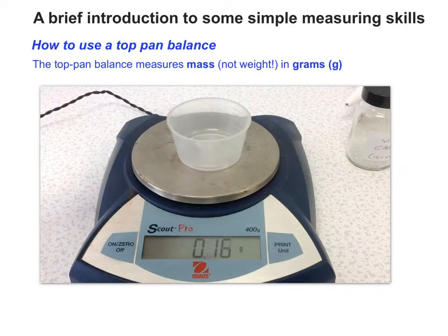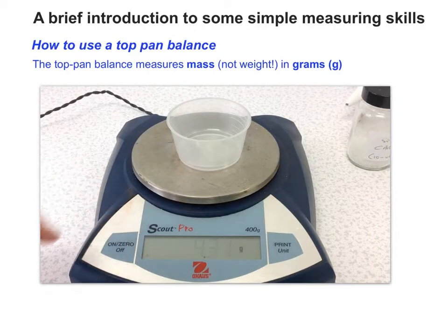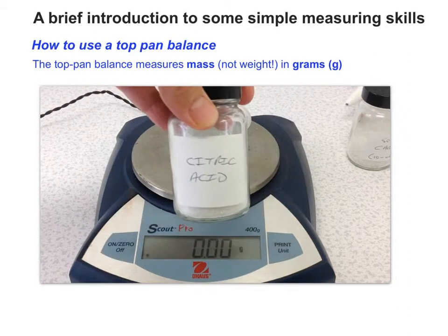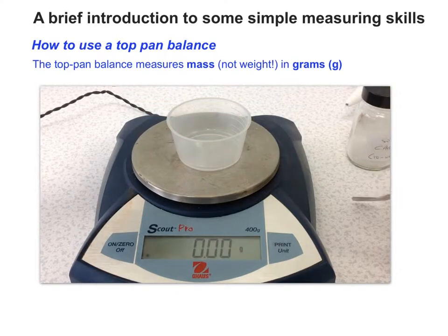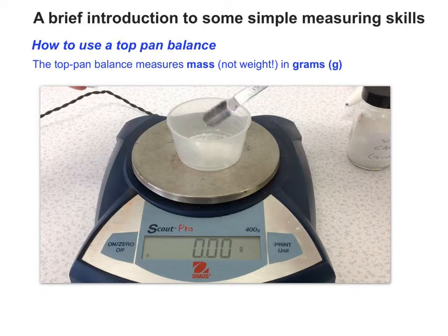I'm weighing the weighing boat, and then I'm going to zero it so the top pan balance reads zero. Now I'm going to weigh citric acid, exactly one gram, so I'm looking for 1.00 grams.